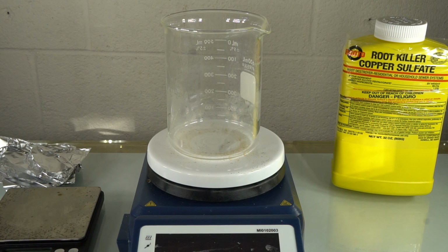And for anyone that wants to try this experiment by themselves, as a general rule, you want to use 13 times as much copper sulfate as aluminum. So if you use a gram of aluminum foil, you want to use 13 grams of copper sulfate. That gives you a slight excess of aluminum, and at least 4 times as much water as copper sulfate.